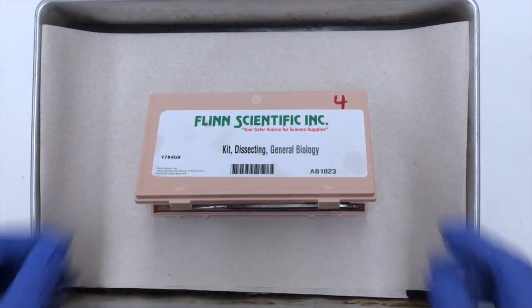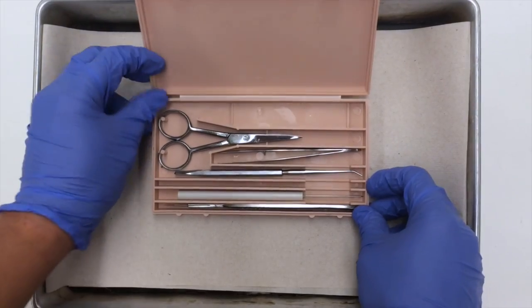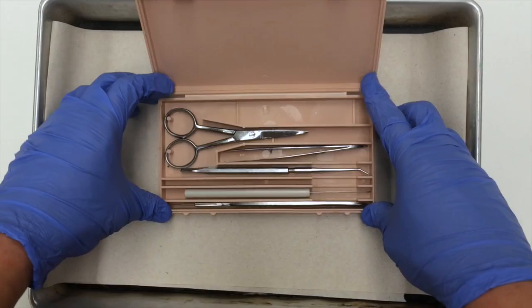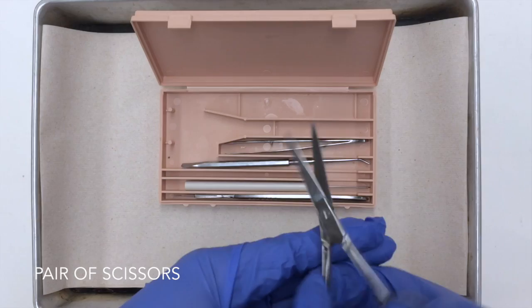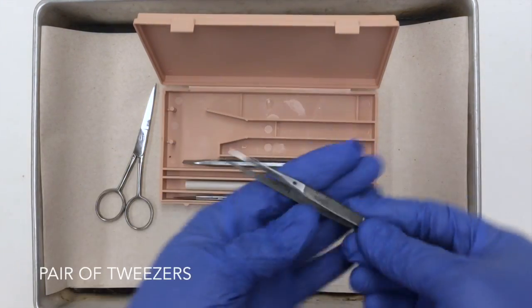Here is a general biology dissecting kit that is also used in the anatomy lab. Notice how organized, clean, and dry the instruments are. This here is a pair of scissors and a pair of tweezers.